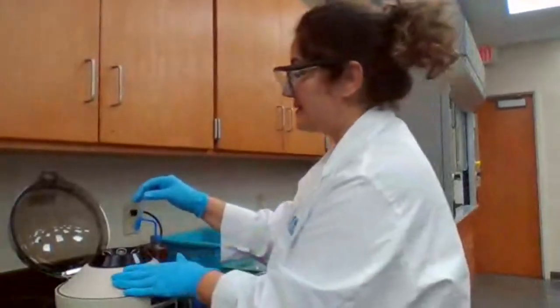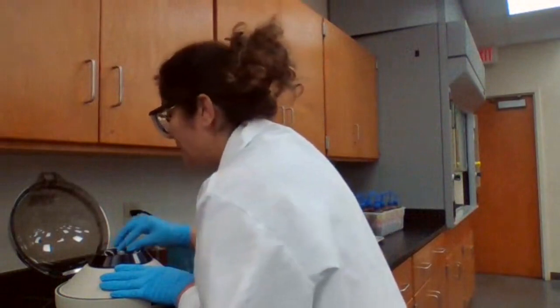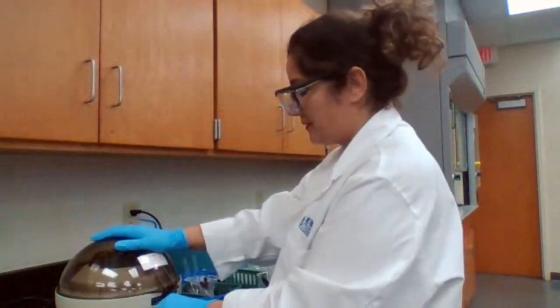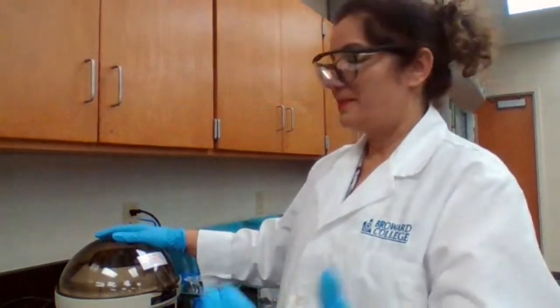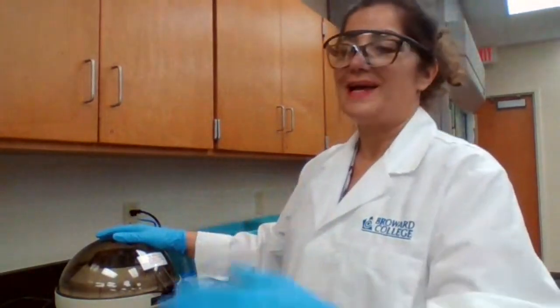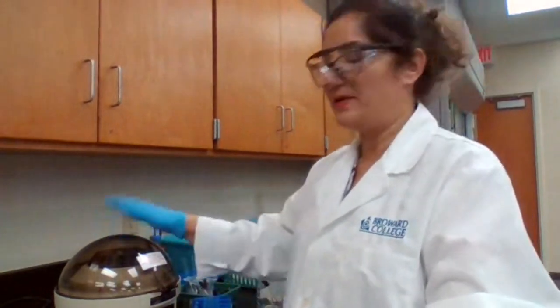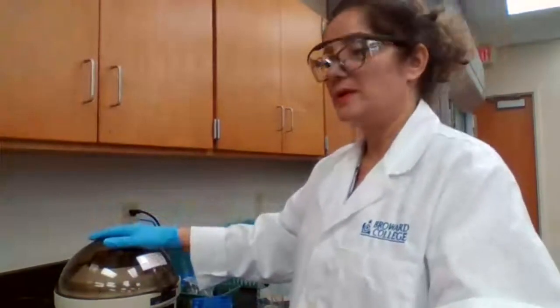I learned it the hard way. If it's not balanced, the centrifuge is not going to be happy and it's going to start moving around. Then I know I made a mistake. The other test tube is not balanced. I have to stop right away. That's the key. Otherwise, it will move around and fall.